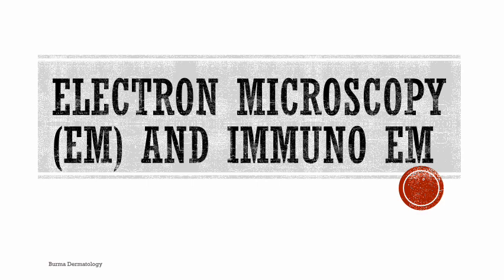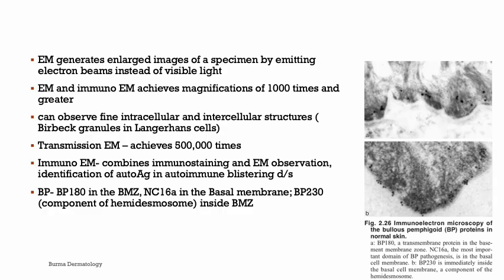Electron microscopy allows the visualization of the ultrastructural details of tissues by using electron beams instead of visible light.